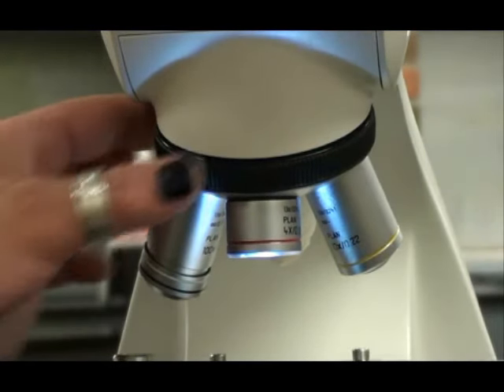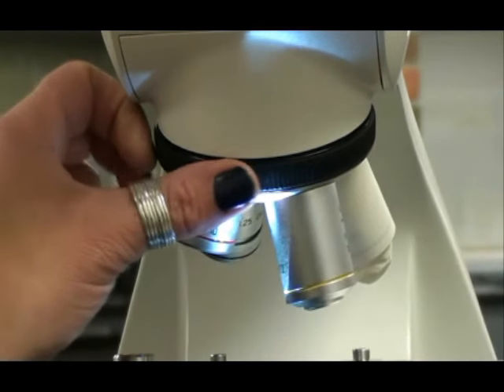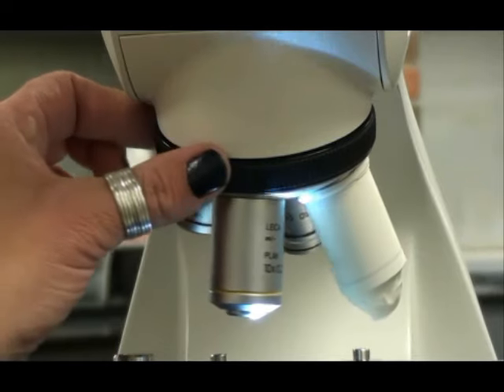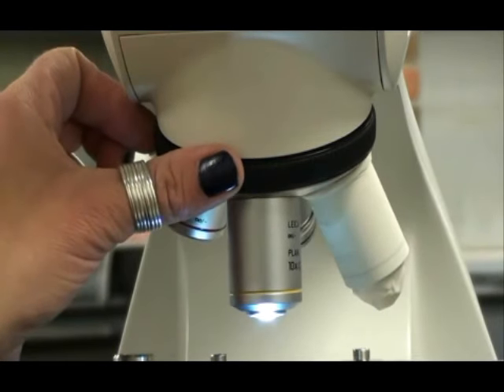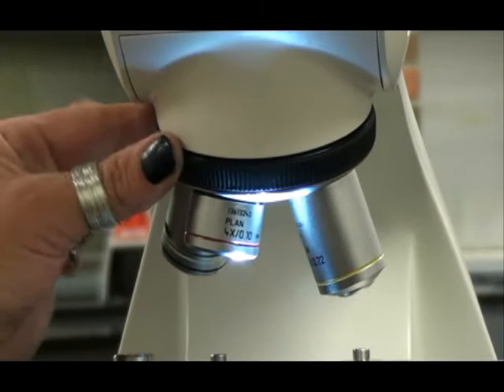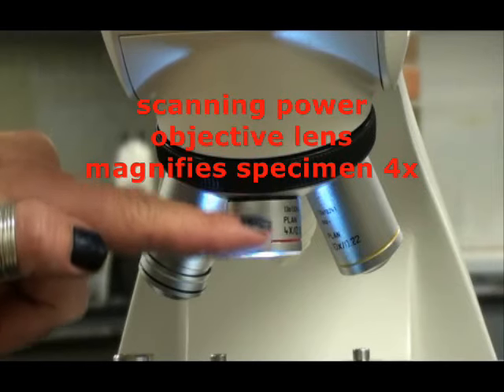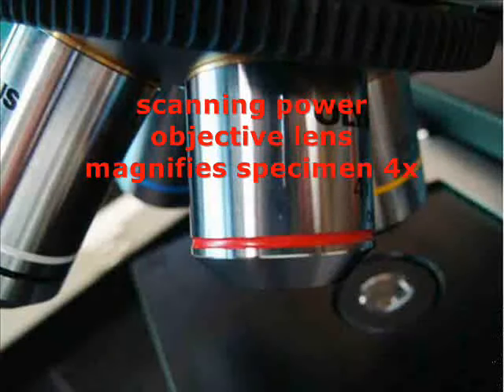The objective lenses are located on a rotating nose piece. Each lens hangs down from this nose piece and can be turned and clicked into position. The shortest objective lens is called the scanning power. It has a red band around it and it magnifies the specimen four times actual size.